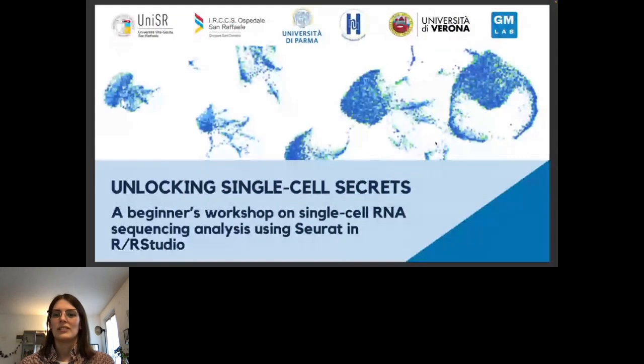Today we will talk about single cell analysis, and we will go a little bit into the detail of the analysis, and we will also take a look at the programming behind the analysis. So I will now share the slides, and you can tell me if you can see them.